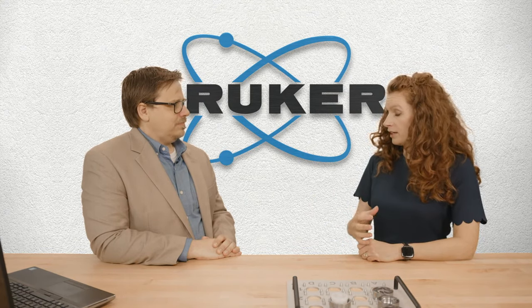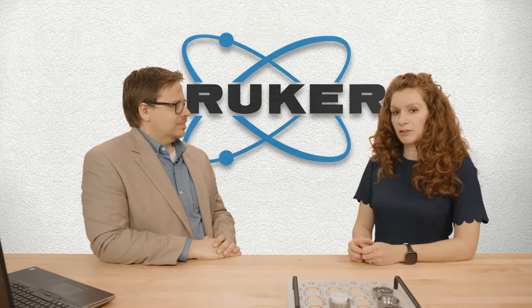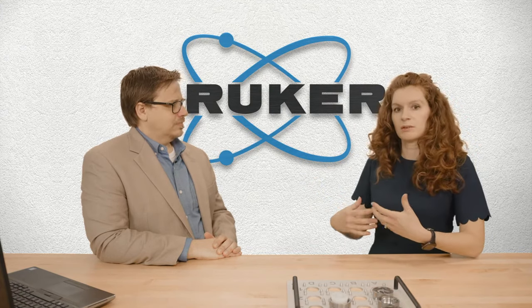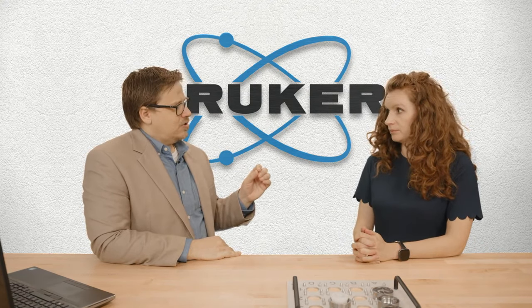And if you want to measure light elements, let's say if you want to go down to boron or oxygen, you might also benefit from having more intense or more power just because you excite more of the element that you're interested in.